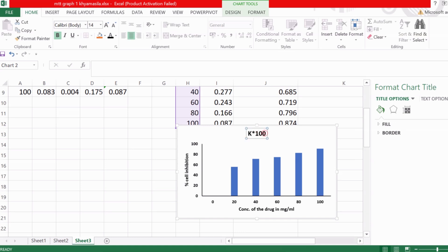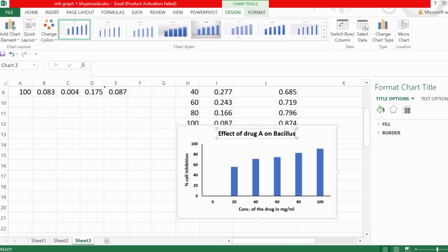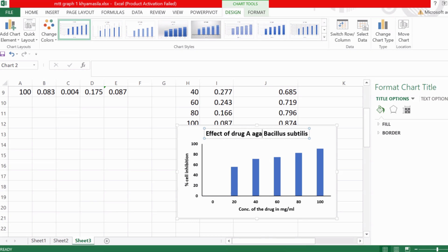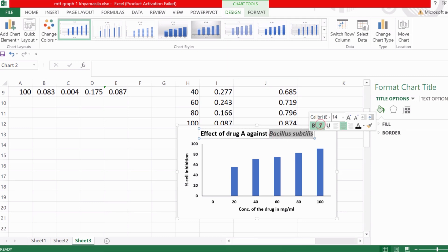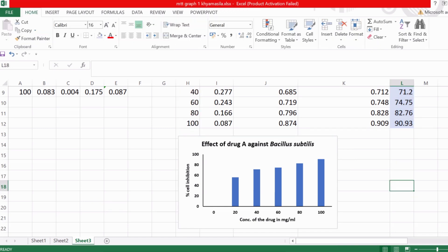Now change the title of the graph. For example: 'Effect of Drug A' — let the name of the drug be A — 'on Bacillus subtilis.' Suppose this experiment was done on Bacillus subtilis bacteria. So write: 'Effect of Drug A against Bacillus subtilis.' This is how you make the graph of the percentage cell inhibition.